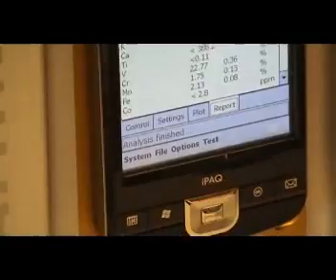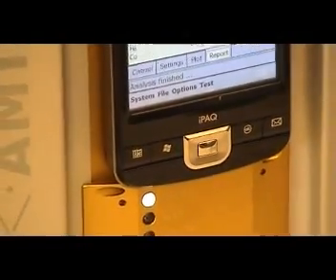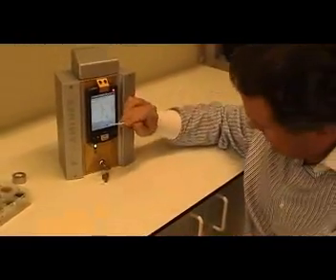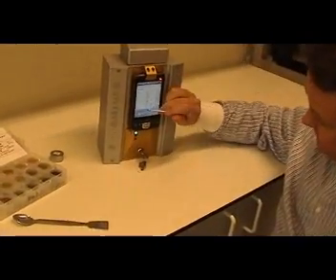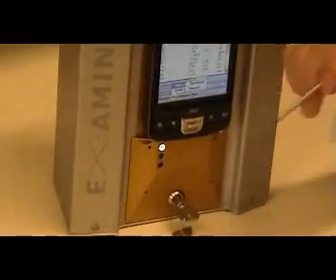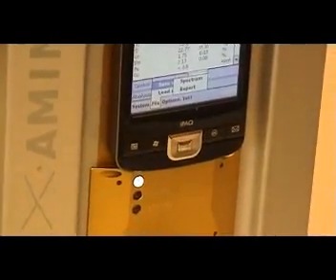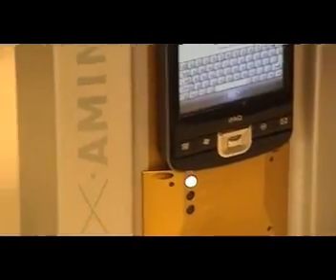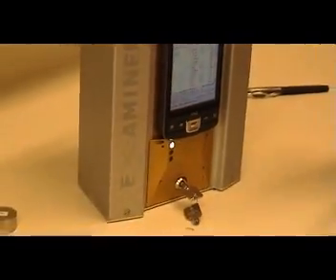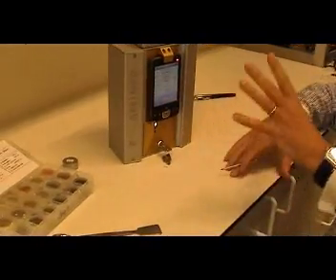This was just a short demonstration to show you how easy it is to use our instrument. What we can still do is save the file for later use. You can save the spectrum, on which you can then work with your PC, or you can save it as a report — give it a name, save it, and then you can send it to your cell phone or to your computer for further calculation.